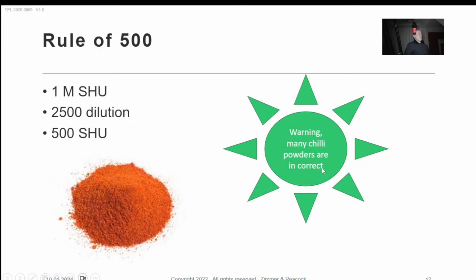So you can get these things quantified either using the FoodSense or using an HPLC. The HPLC, I've got a suspicion, is so expensive that, for example, somebody may have a pallet of chili powder and take one sample from that pallet and test it, and then just assume that it represents the entire pallet. But chili powder is really heterogeneous, so you can't make that assumption. You have to test it in a lot more places to understand the range of chili powders within that sample.